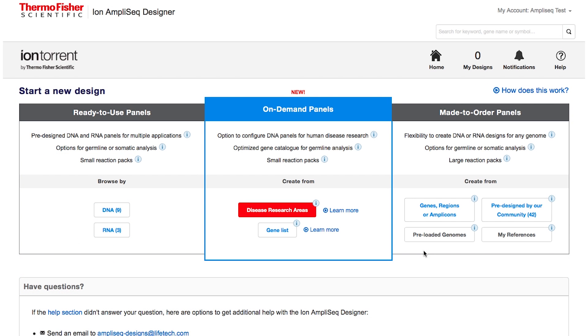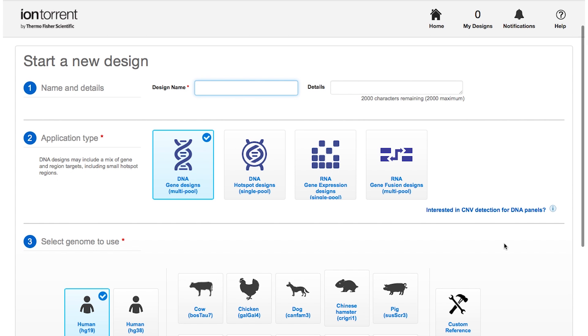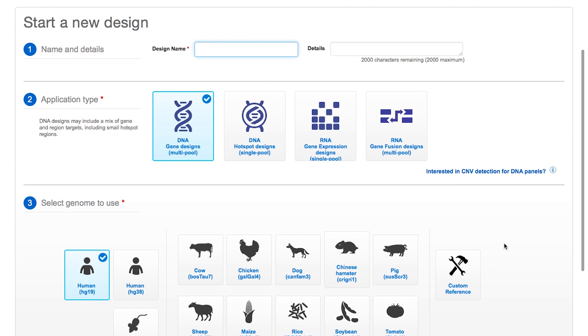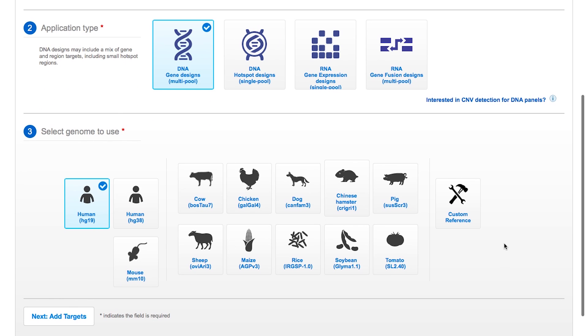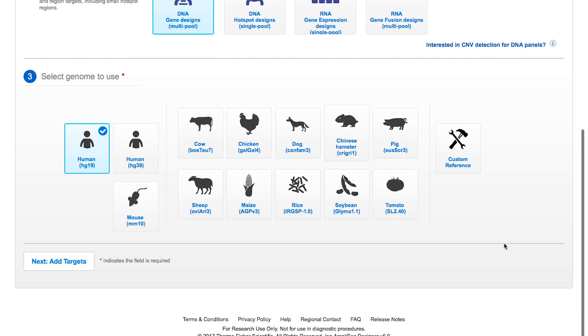For maximum flexibility, create a made-to-order panel and customize by your gene definitions, regions, or pre-calculated amplicons for any reference genome.